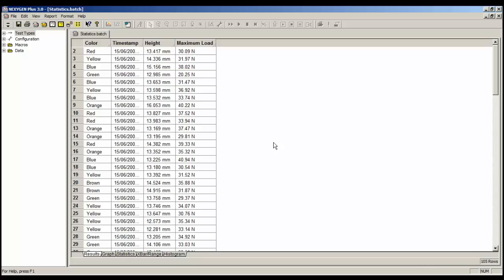The results table shows that there are many rows, and each row is a single test. Down in the bottom right-hand corner, it shows me that there are 105 tests in this batch file.